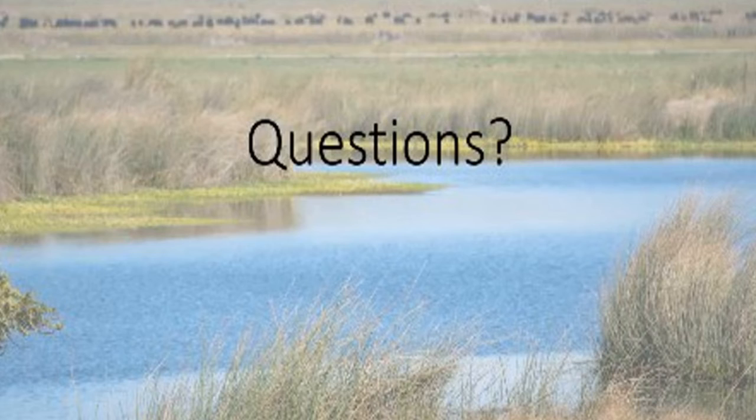That is a really good question. And the answer I most often go to with eDNA is that it depends. It depends on the environment that you're in, and how much sunlight is in a system, because that can degrade eDNA and eRNA as well. But I know that there are studies, and Susie, correct me if I'm wrong on this, but I think the distances can range from a couple meters to a couple kilometers.